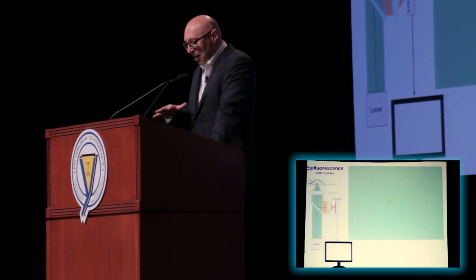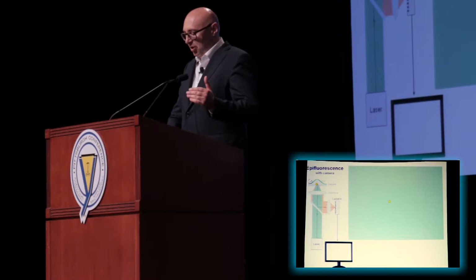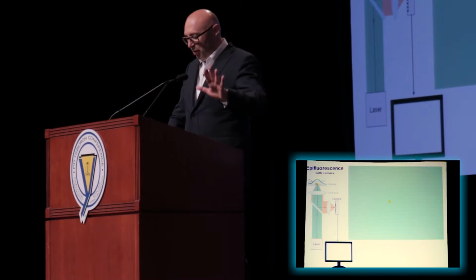I'm coming back again to the way people usually localize molecules. In essence, MINFLUX is a new way of localizing individual molecules, not in a conventional way with a camera, as is usually done in single molecule tracking or PALM/STORM and so on, but in a different way. So I'm kind of starting from scratch, and I'm going to explain things now from the beginning. So in case you didn't understand something before, don't worry. Now is the big opportunity to start anew.